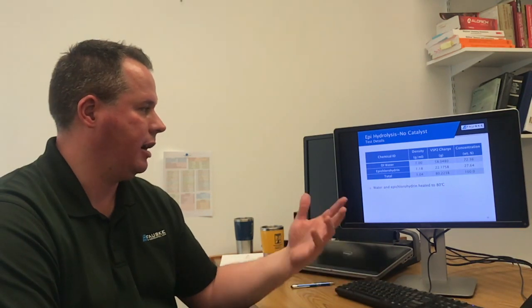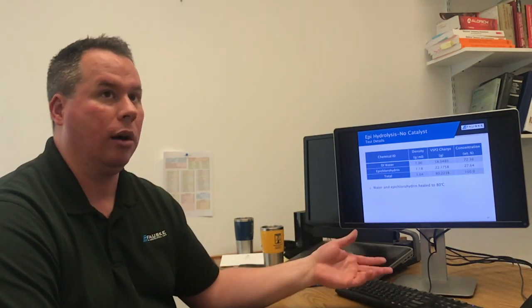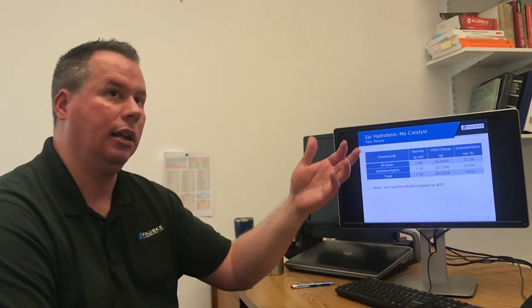So I added the epichlorohydrin and water into the test cell at room temperature, loaded that into the VSP, and heated it up to our 80 degrees C process temperature. So there's no metered addition this time.